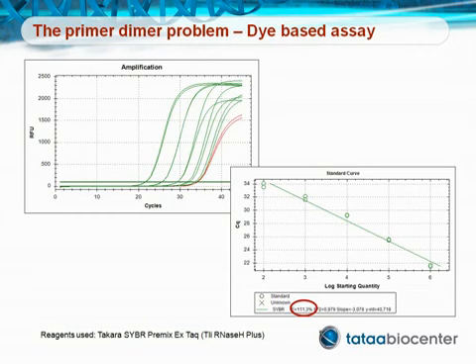You should not quantify samples that are outside the linear range of the standard curve. So you first need to remove the points with too low concentration so that your straight line fitting can be made correctly.